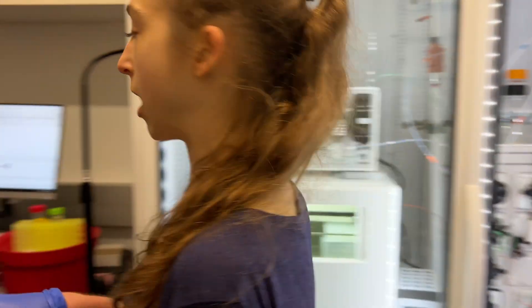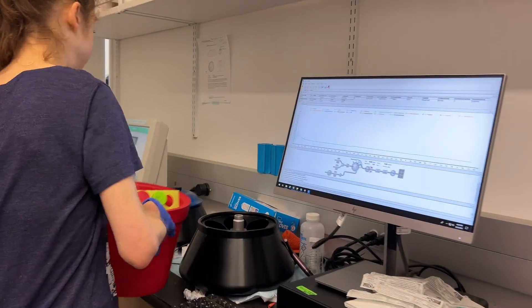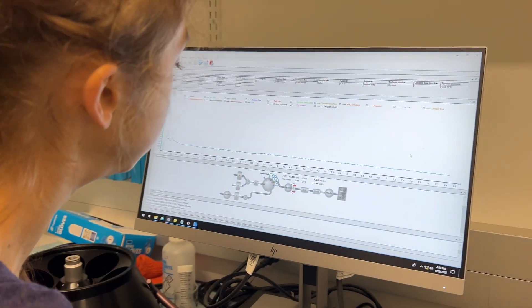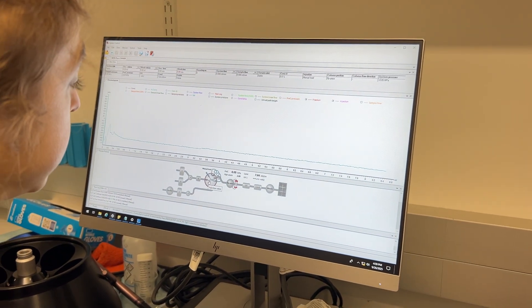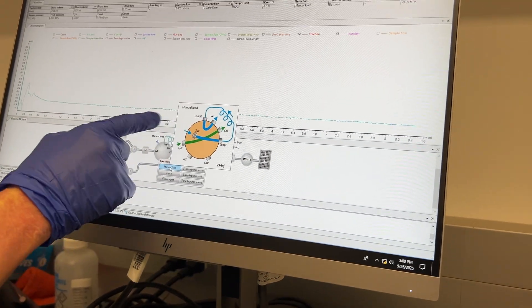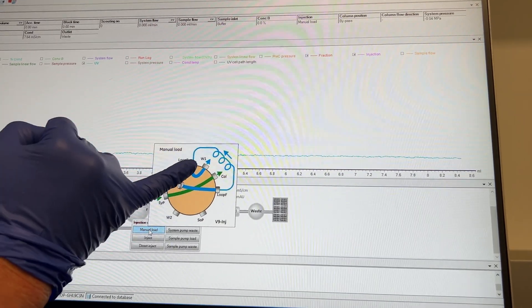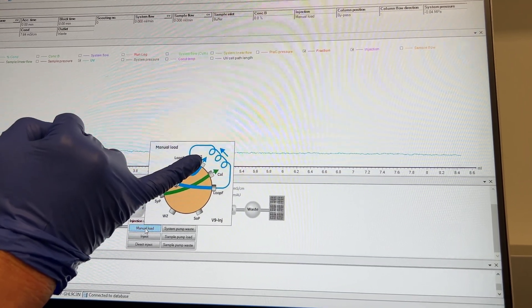But first we need to make sure that we're actually set to inject through the loop. If we come over to here — this is our Unicorn system control — we can see the injection valve setting. Right now we're set to manual load, which tells us that when we inject into the syringe port, it's going to fill the loop and any excess is going to go into the waste.